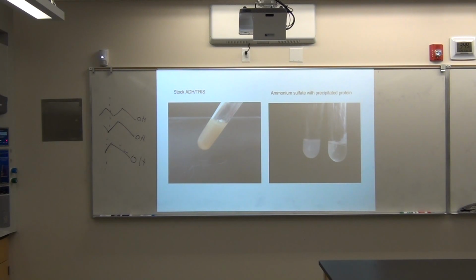It didn't work because we didn't have the right salt and the right polymer. We used results from last year's. We made a real educated guess, but still we were basically throwing a dart at a blank piece of paper. So I think that these aqueous two-phase systems can be used as extraction and purification, but there's going to have to be a lot of upfront work to figure out what the best polymer and salts are for different types of molecules. Because what we've found for sure is that there's simply not one that's going to work for everything. That was kind of discouraging, although not entirely surprising. But I thought it was cool.